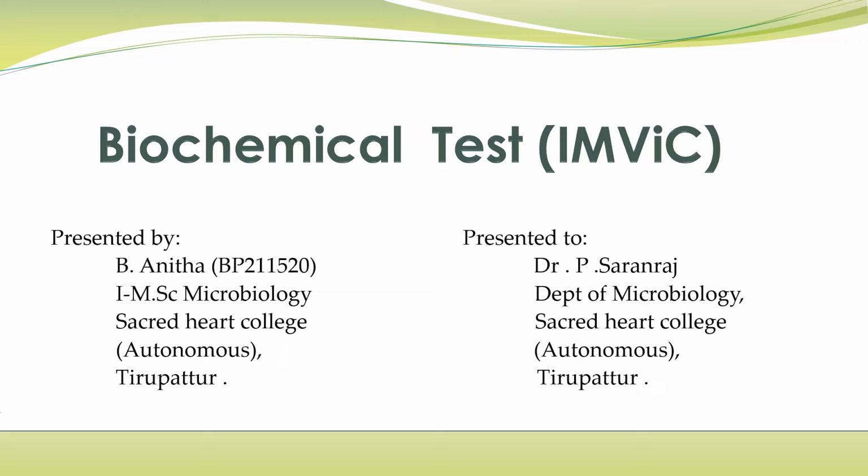Today we are going to discuss biochemical tests. The main aim of a biochemical test is to measure the levels of bacterial enzymes, which is interpreted accurately to identify the species of a bacteria, by whether it produces those enzymes or not.